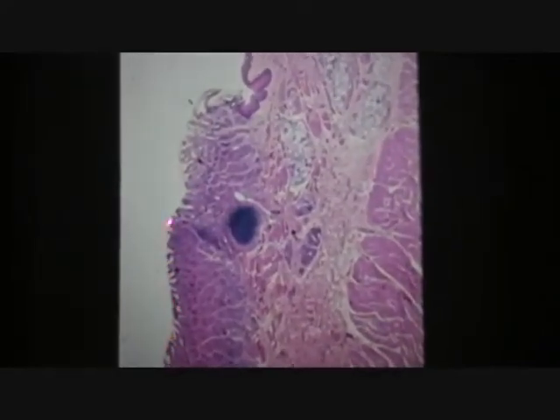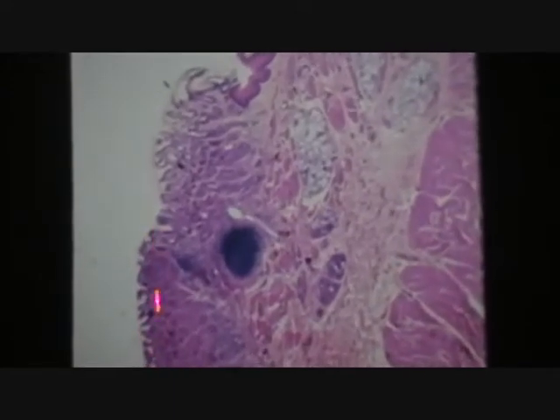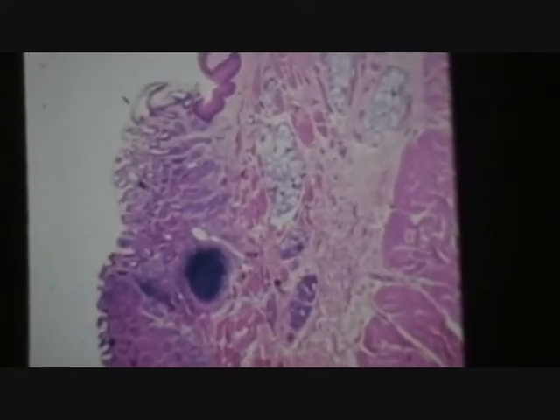And then you note it's pitted. You get this pitted appearance typical of gastric mucosa. We'll concentrate on the fundus and the body. Don't worry about the cardia or the pyloric end. And most only need this rugged look on the surface to tell that this is gastric histology. Pinholes, gastric pits at the top, gives it that rugged look.